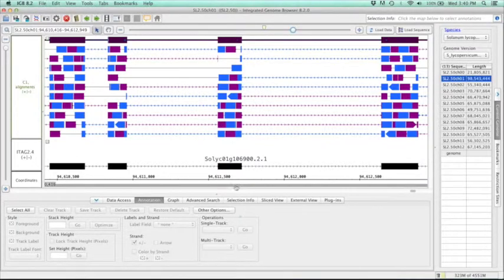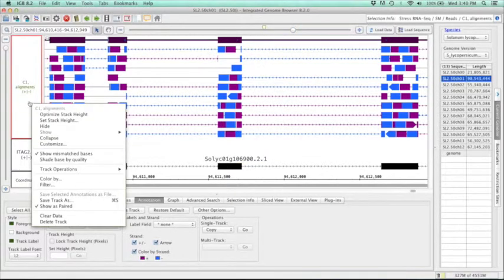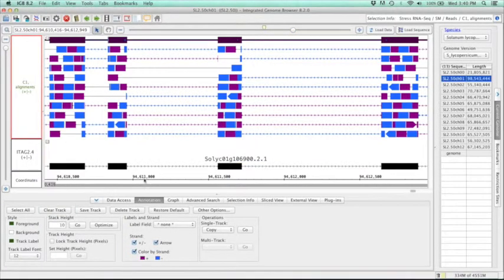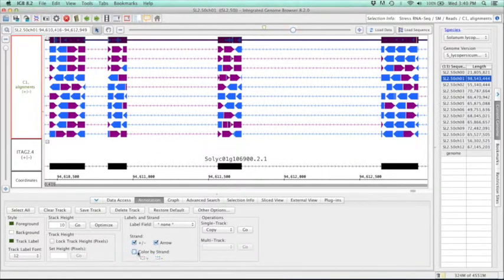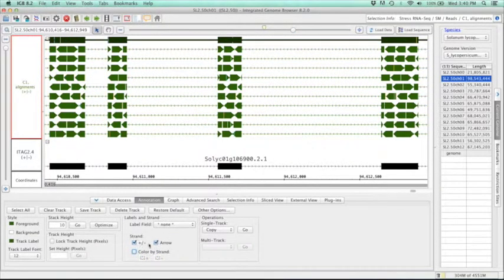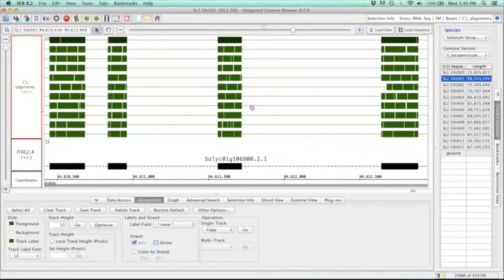But if you do want to turn off the paired end visualization, all you need to do is just right click here, uncheck the show as paired, and then you can come down here and remove the color by strand and arrows. And we're right back to how that data looked originally.